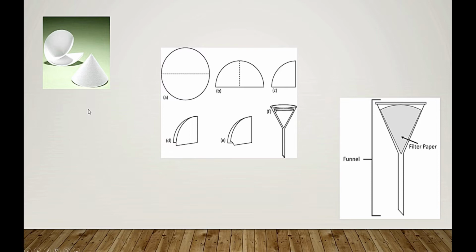from filter paper, any liquid can easily pass and solid will remain over here on the filter paper. The liquid which will pass from filter paper will be known as filtrate, and impurities or solid particles which will remain on filter paper are called residue.